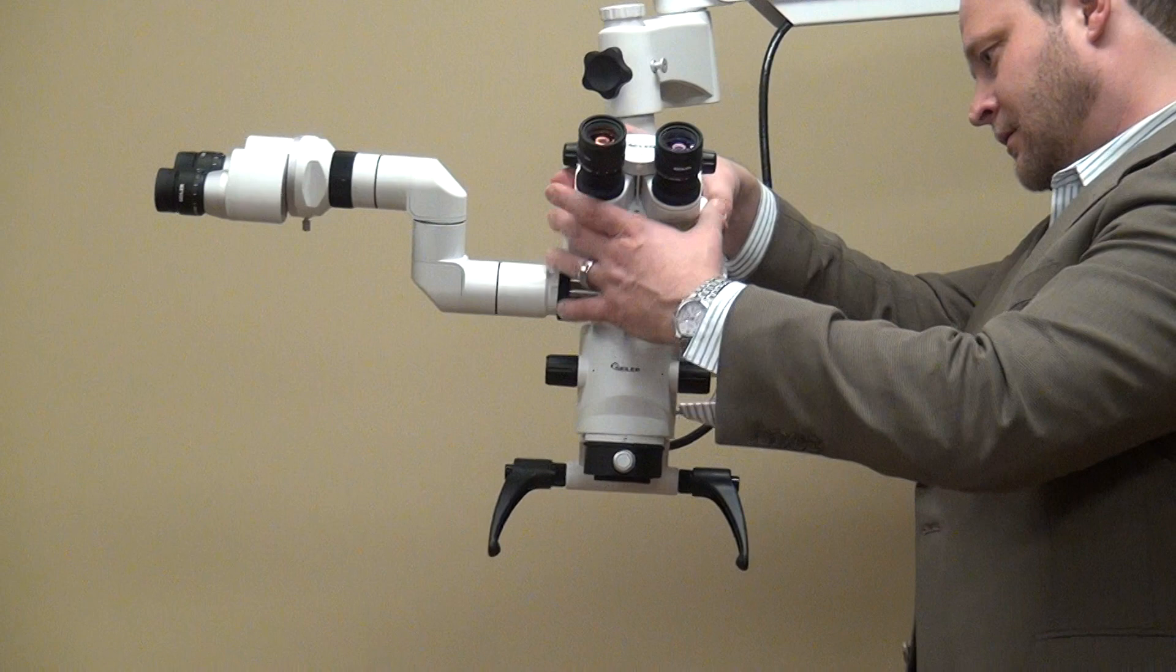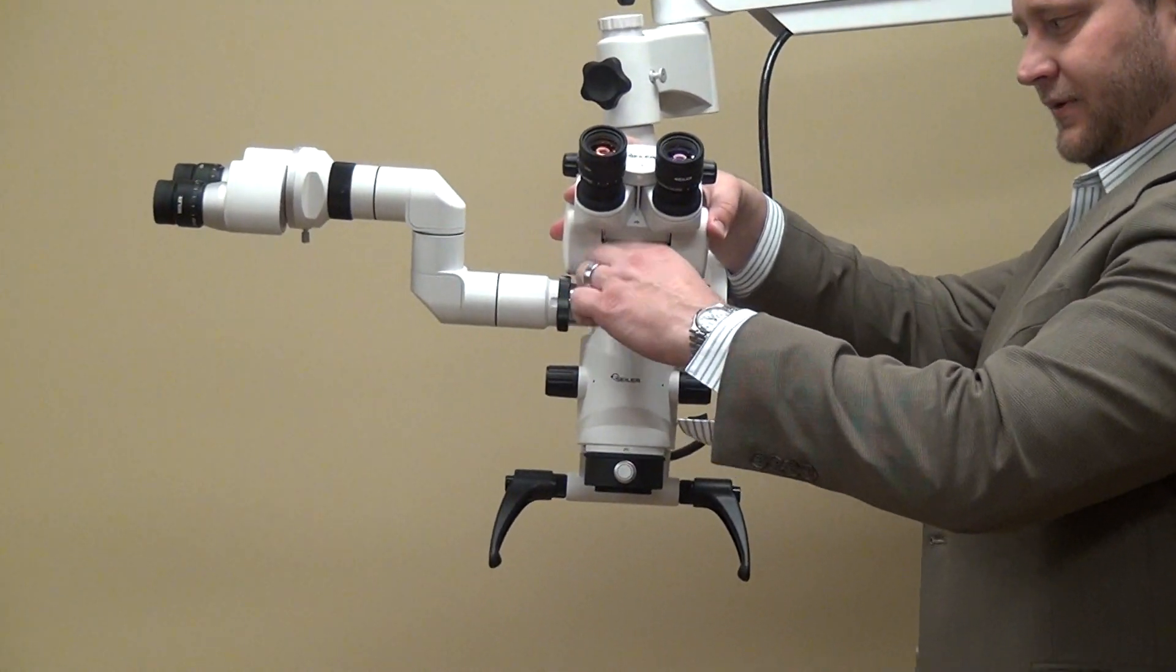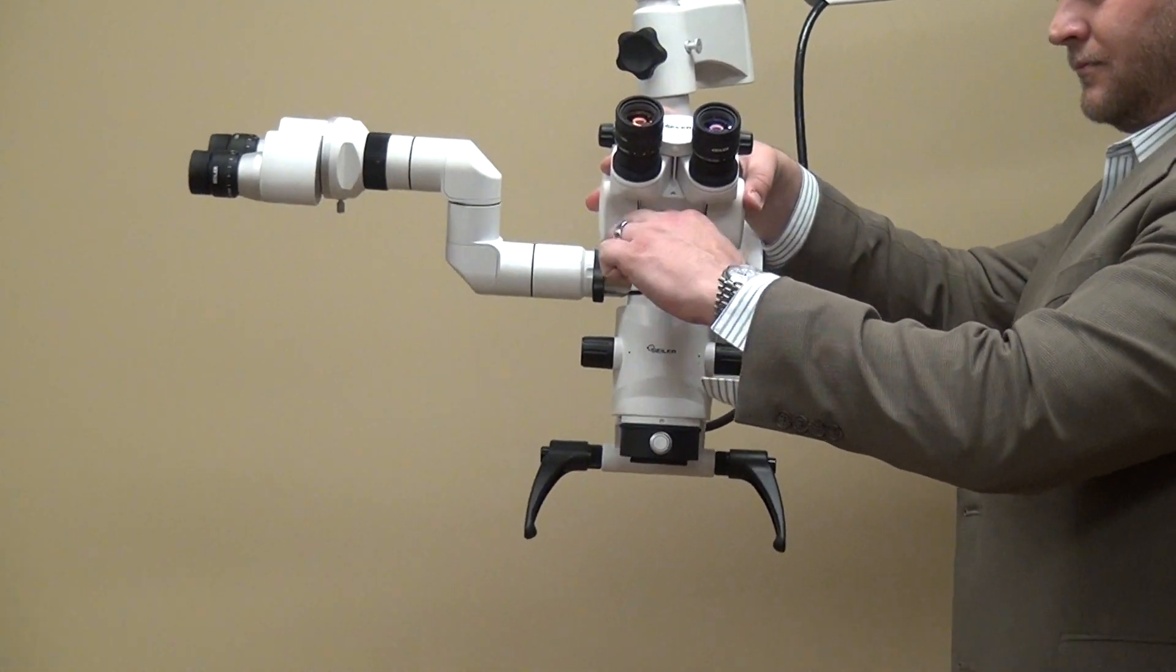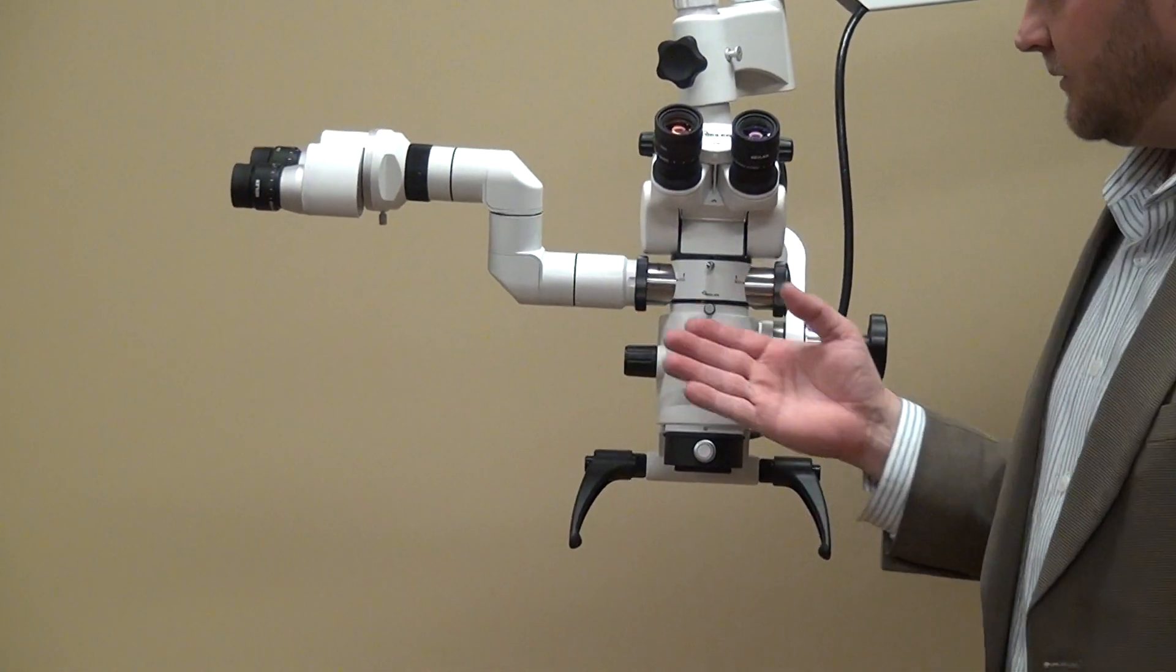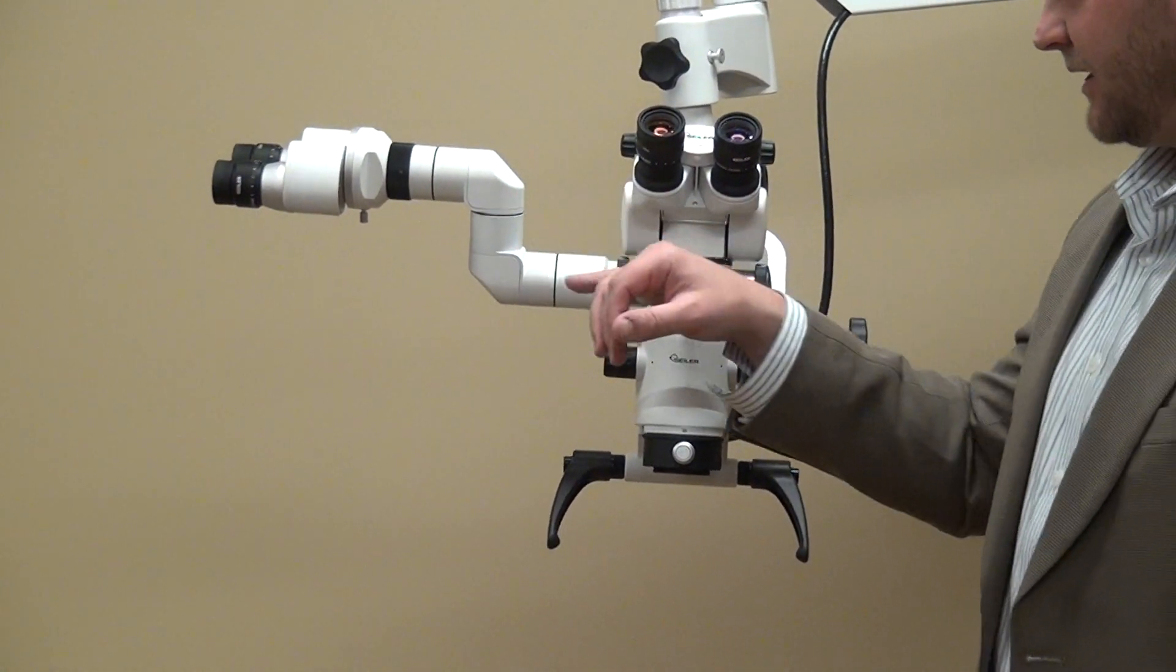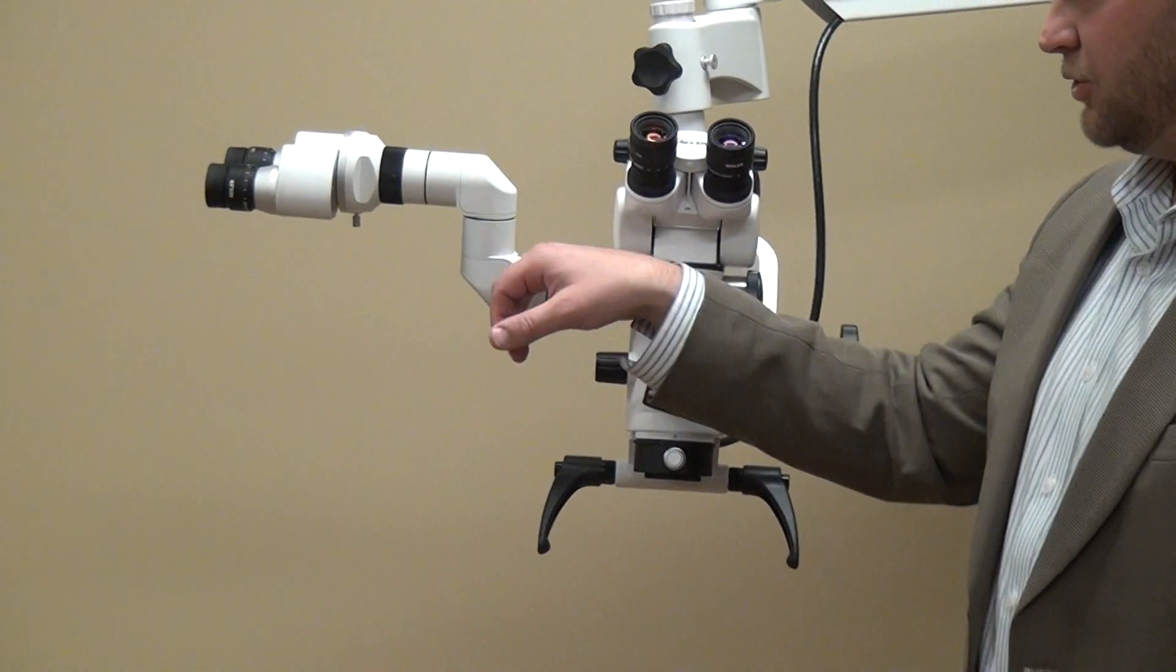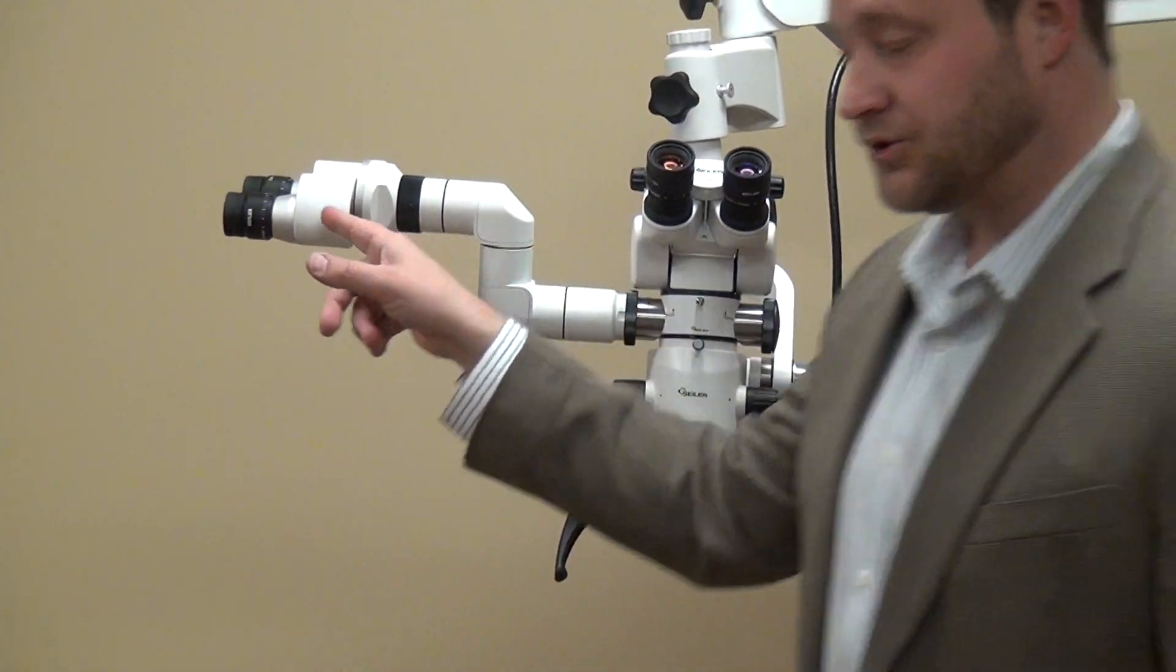So put this in and this is your assistant binocular head. So you've got your beam splitter, tube coupler, and your straight binocular head.